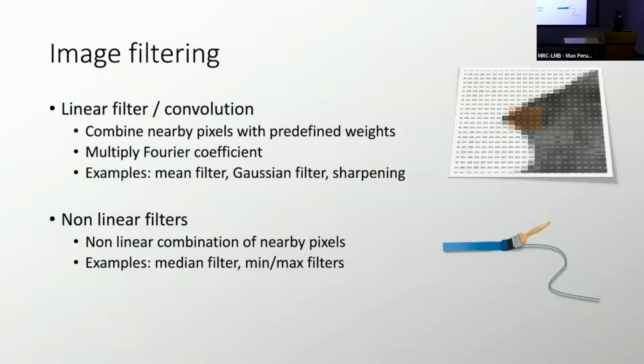So we have a link between the convolution of the image and the multiplication in the Fourier domain. And so we can achieve various aims by doing this. We can simplify the image by taking an average, reducing the noise level by averaging. And then we could also sharpen the image to amplify edges, detect edges, or spots, features using simpler filters.